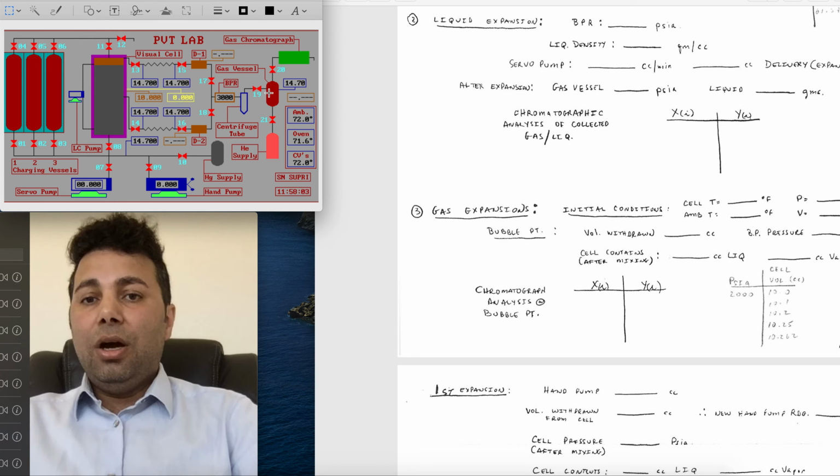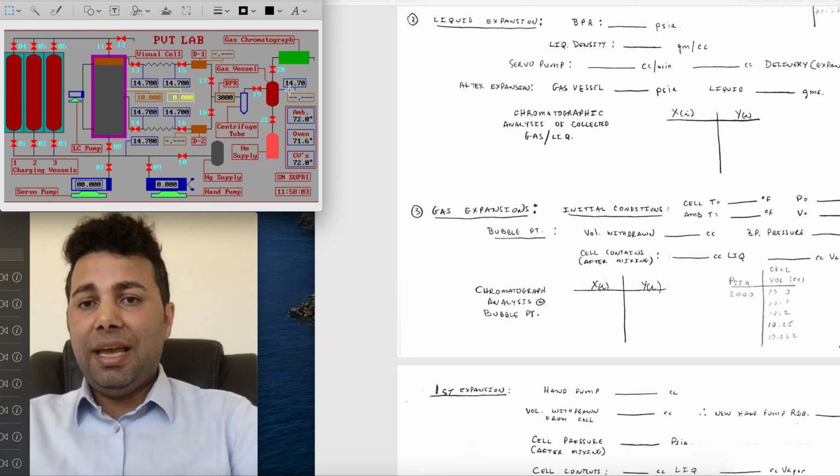And then I'm going to use F8 to put the vacuum. If you press F8, it's going to put the vacuum on this helium cell and simply evacuate it. This pressure goes to 0. I make sure there is no air in it. I make sure the pressure is equal to the back pressure regulator.